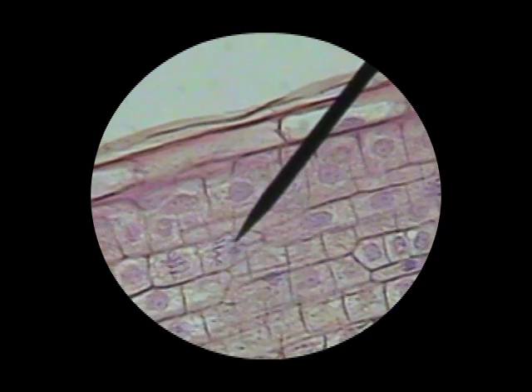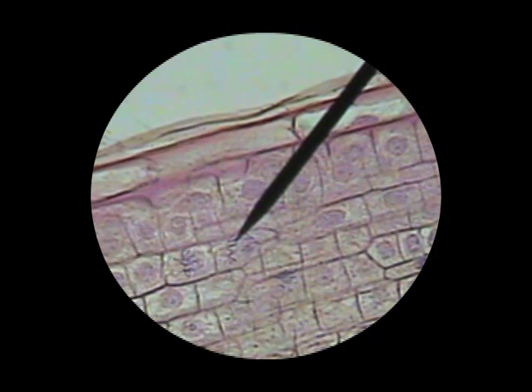Especially in compound microscopes, there may be a pointing device in one of the ocular lenses. Students and teachers use such pointers to help communicate with each other about what is being observed.